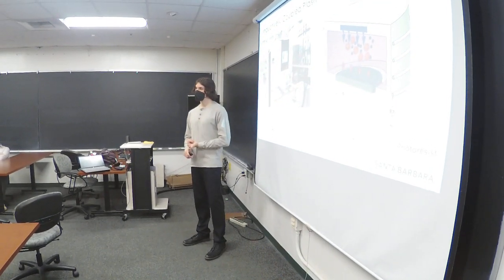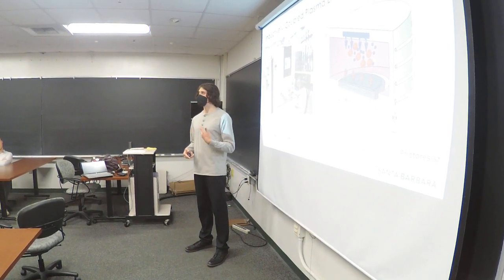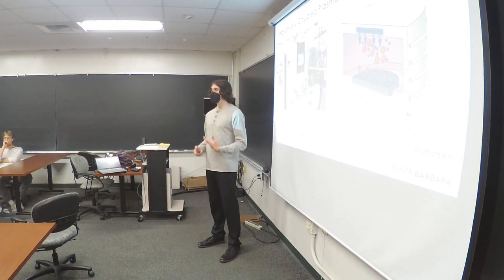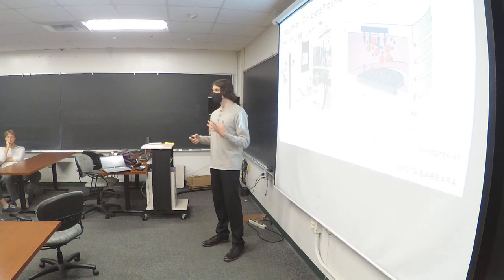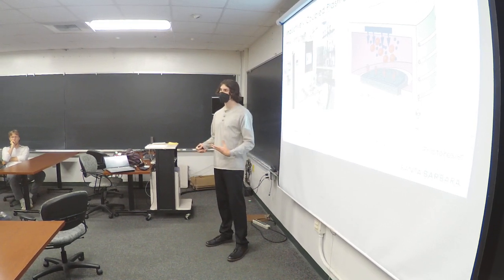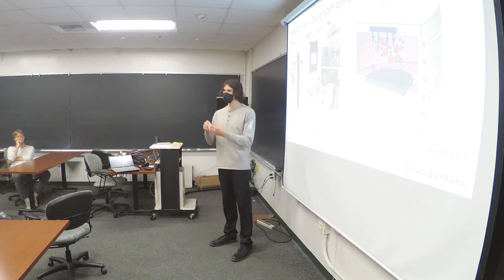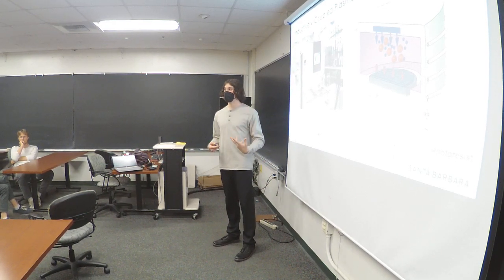Because you'd have to have amplification, because the signals from the neurons, to give an example, range from, I think, 100 to 500 microvolts, which is very, very small. So you need a large amount of amplification. At the same time, there's going to be all this noise and artifacts that you want to filter out. So you've got this combination of an amplification stage and all of this filtering, and then you need to convert it from an analog signal to a digital signal so that you don't have this decrease in the amplitude, and you'll actually be able to read the signal at the end. But you can buy something that does all this complicated electrical engineering for you.